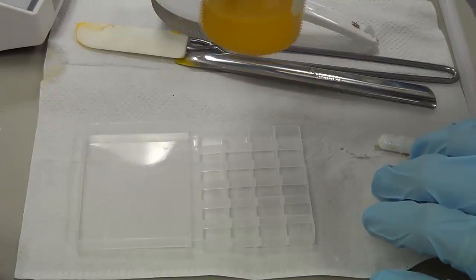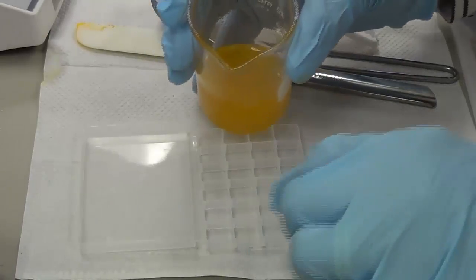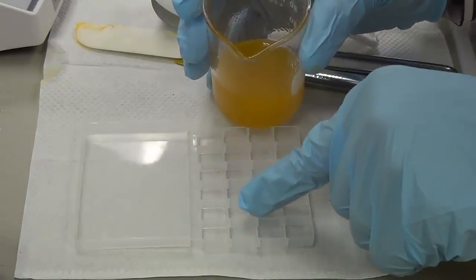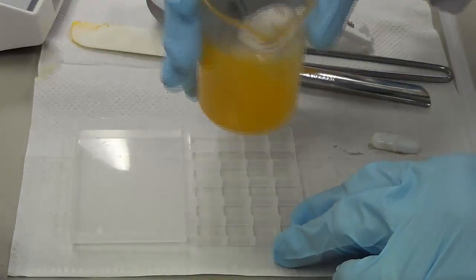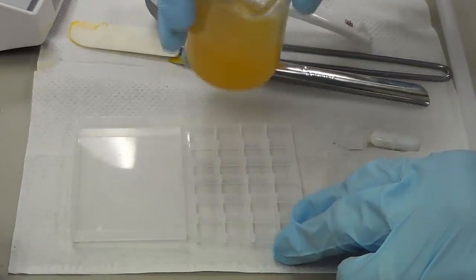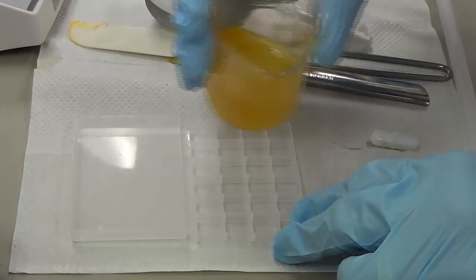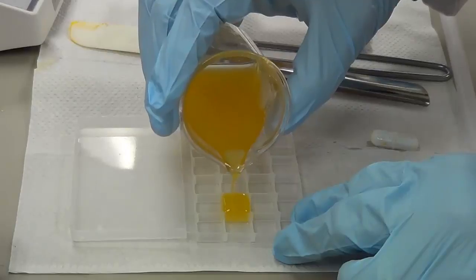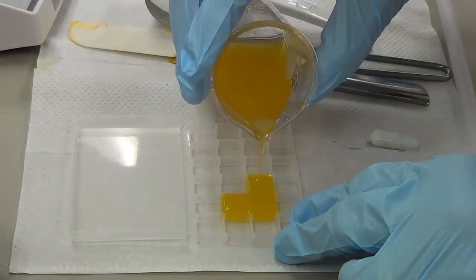Now this is lukewarm and I'm going to pour it, starting at B2, that is here, B2. Pour it and stir it, pour it and stir it, so that you have uniform dispersion of the drug in all the troches. I'm going to pour it in B2 and go to the next one.